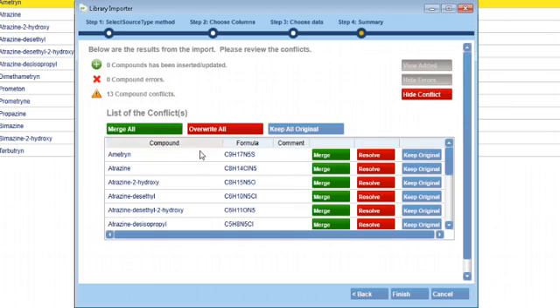Merge allows you to bring in new information that might be present in the compound you are currently importing, but not in your current compound database. While the new information could be anything, a good example would be a new spectra with a different collision energy that was not in your database before. Merge allows you to add this data.